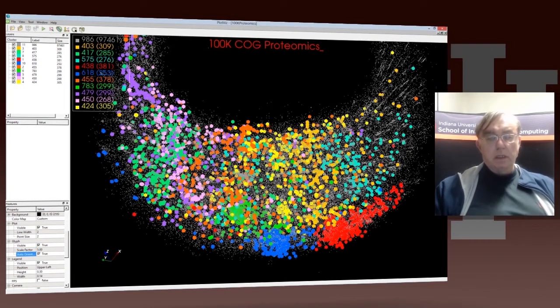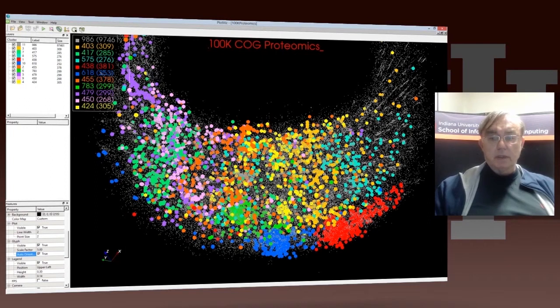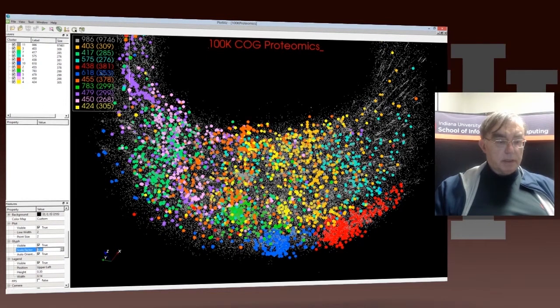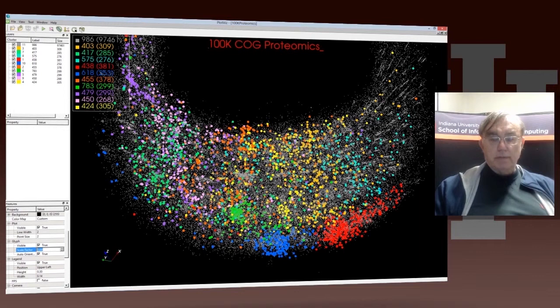So this is looking in detail of what's going on. So maybe we think those glyphs are now a bit too big. Let's get them down to three. So now that's pretty clear. You can see the advantage of making the glyphs when you're studying a small sample of the data.